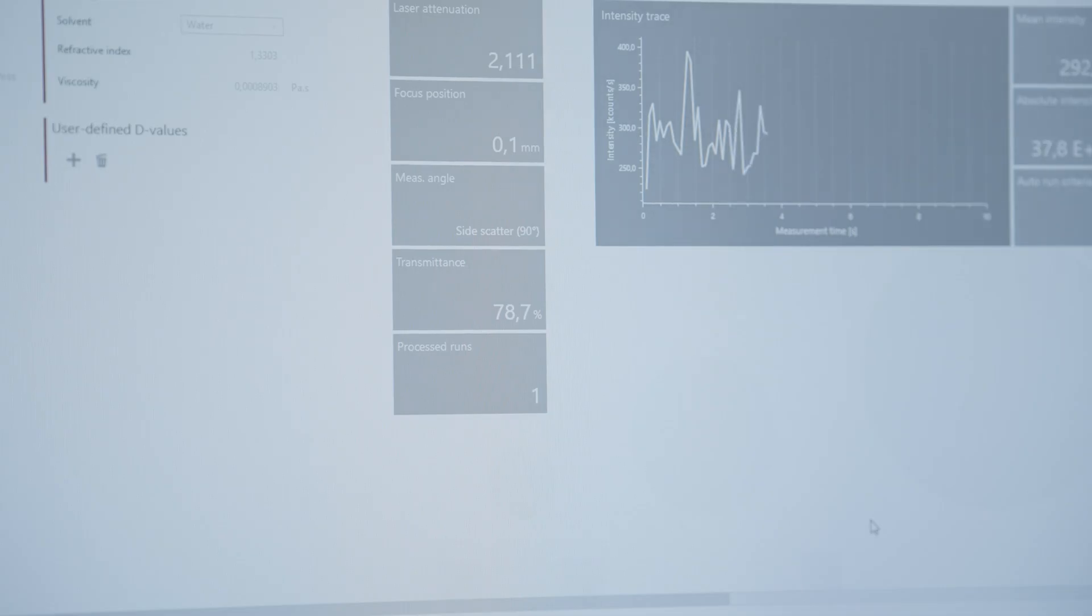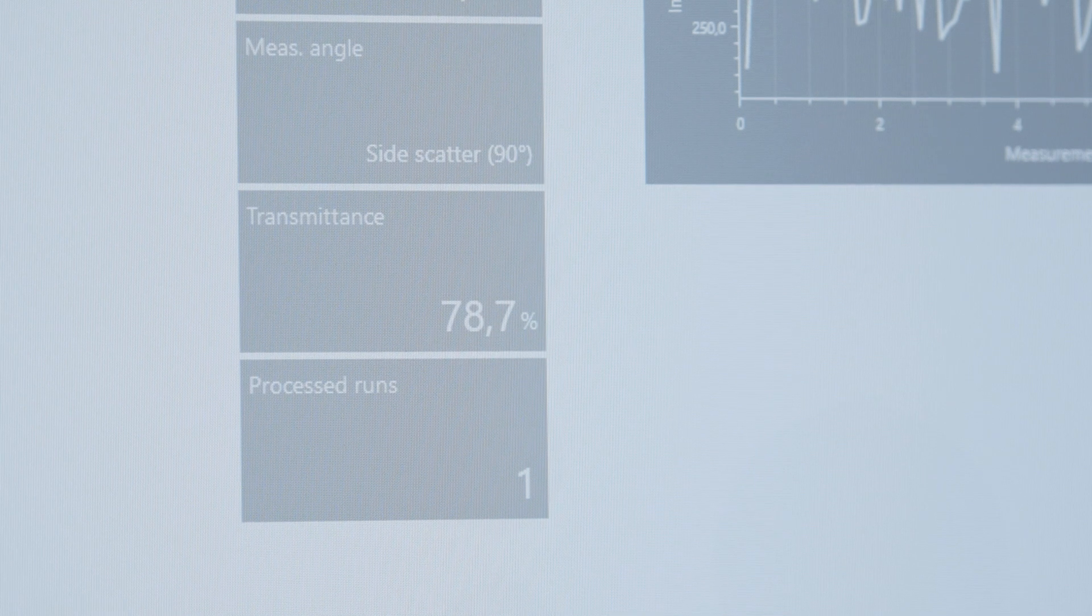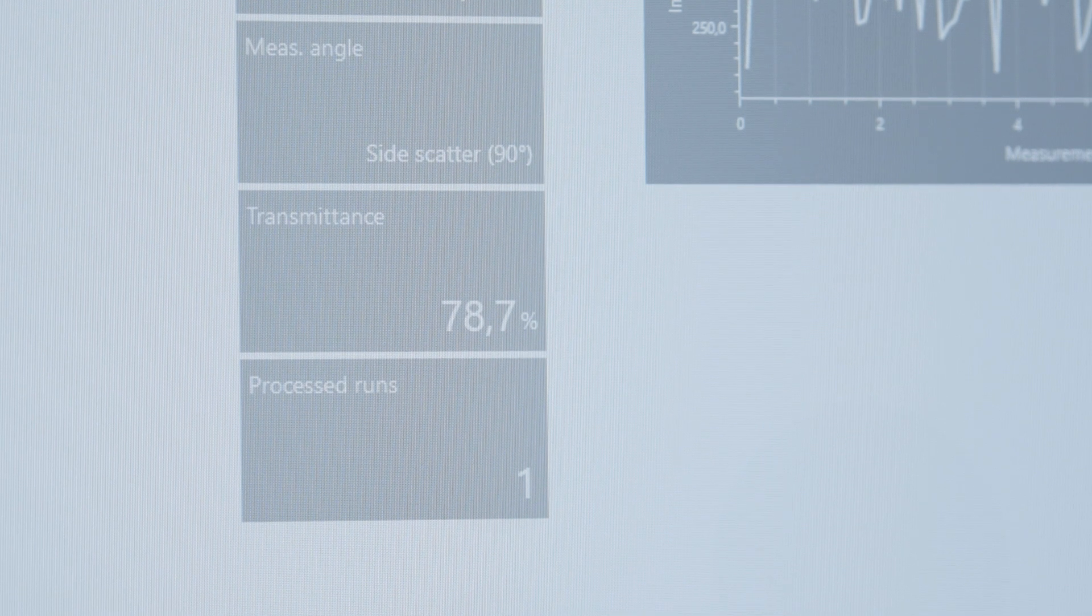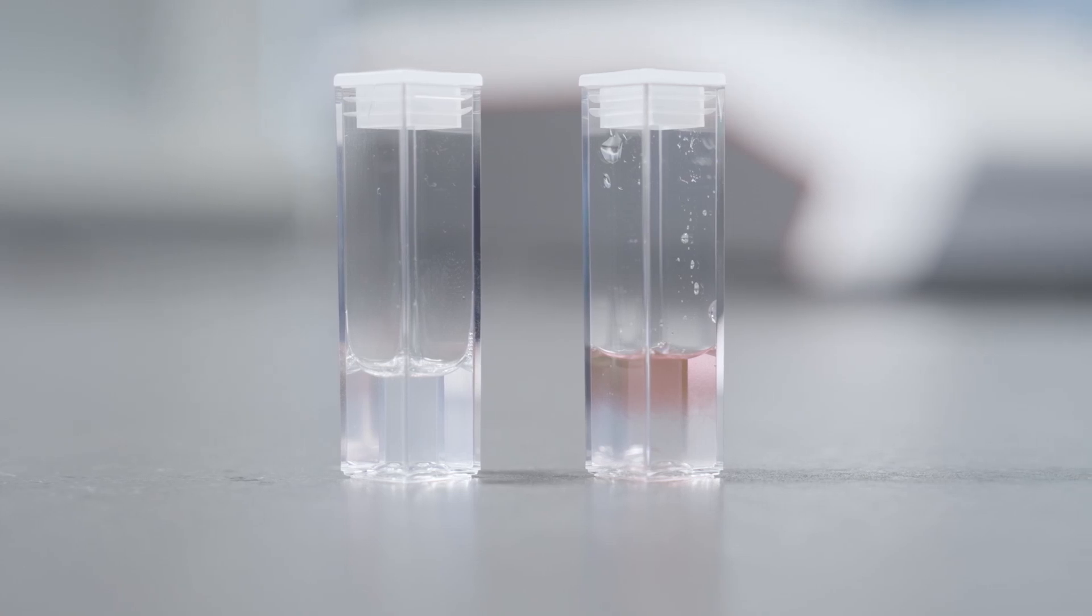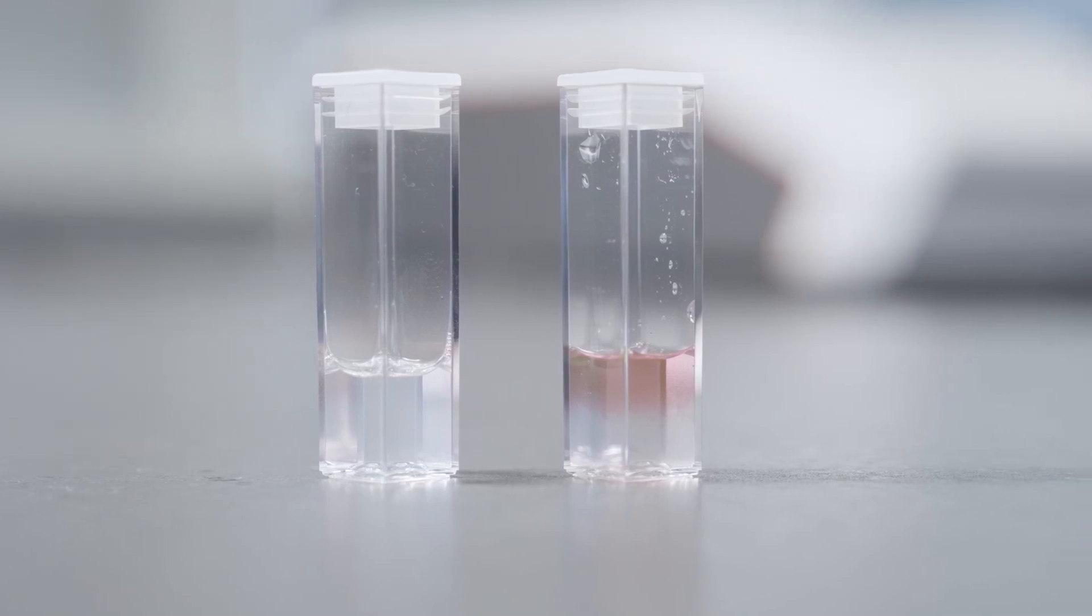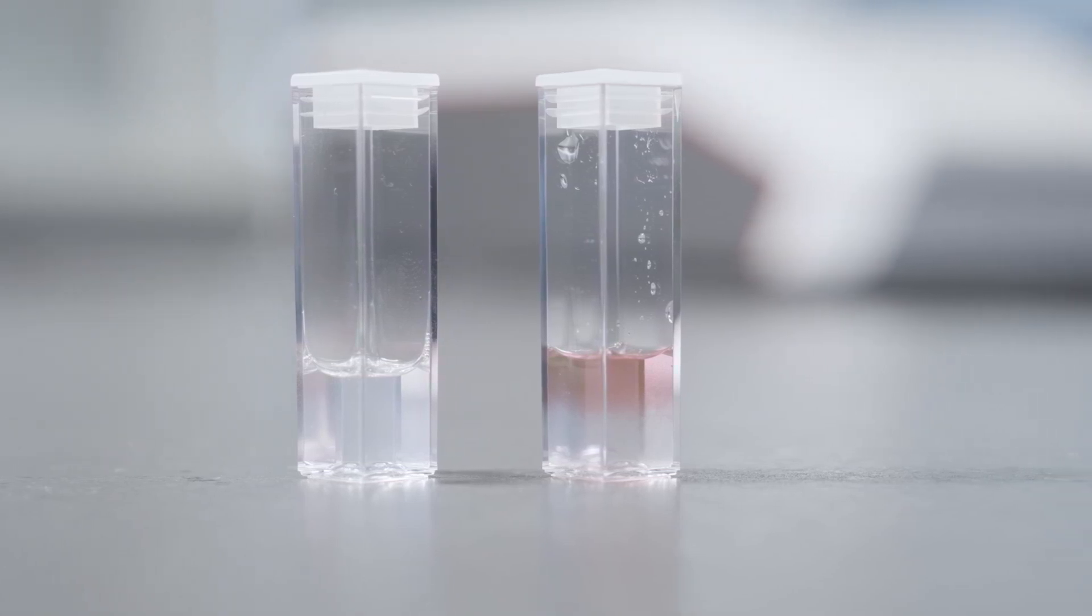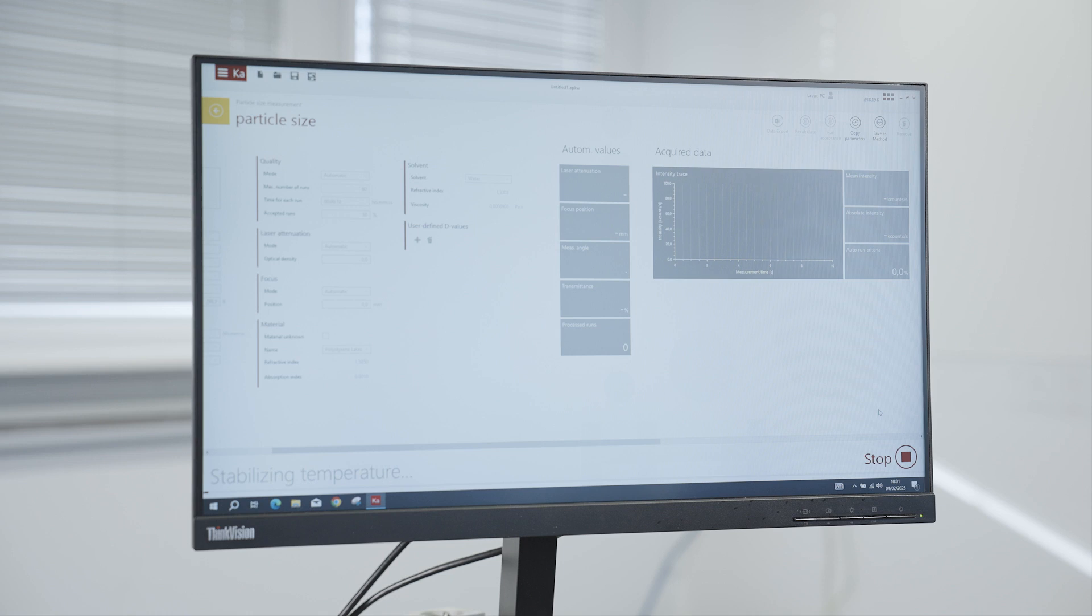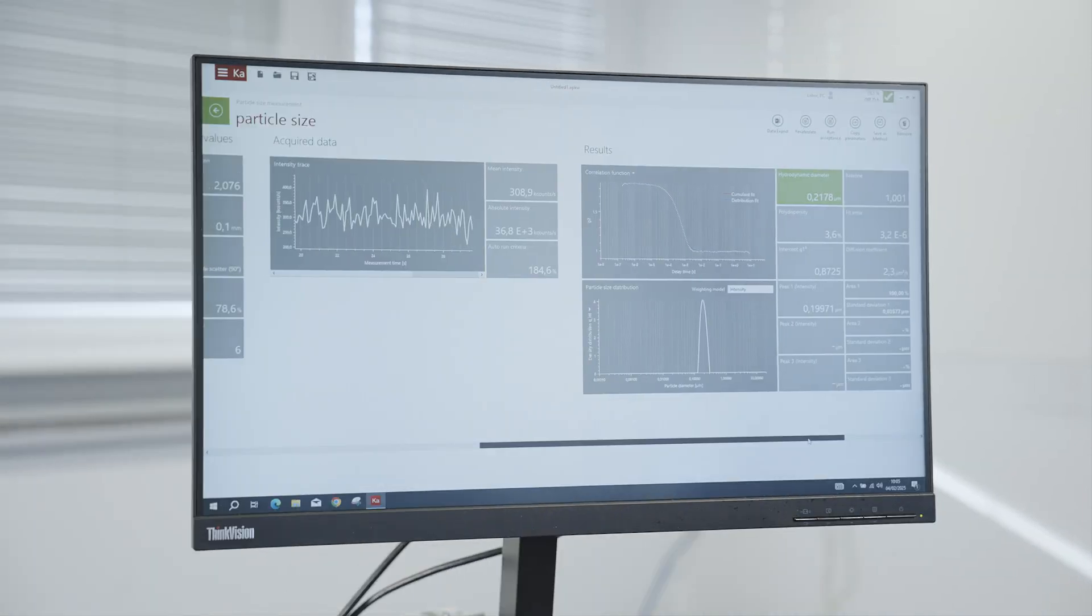A unique feature of the LightSizer DLS is the continuously monitored transmittance during the entire measurement. This allows the user to observe, for example, sedimentation of the sample in real time. The results are displayed on the same screen as the parameters.